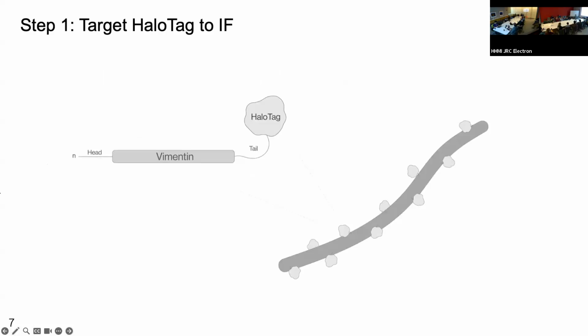Now, there's a whole suite of tools that have used photosensitizers in the past. These techniques are called CALI, chromophore-assisted light inactivation. And the thinking there is if you shine a very bright light at a fluorophore, you can oxidize whatever is associated with it in a very local neighborhood, about 5 to 10 nanometers is sort of the half damage window of these ROS, and inactivate it. So we said, what if we do the same approach, but try to refine it a little bit?